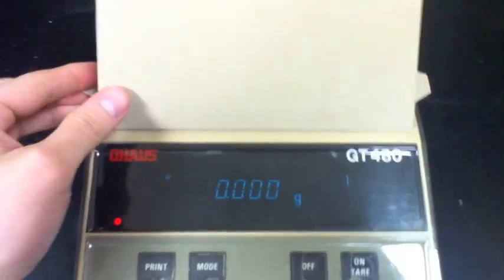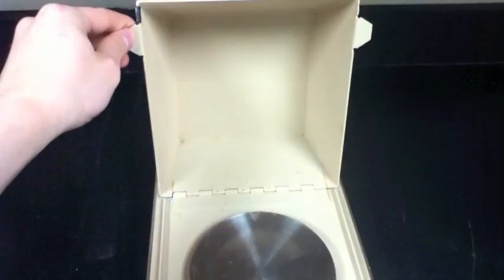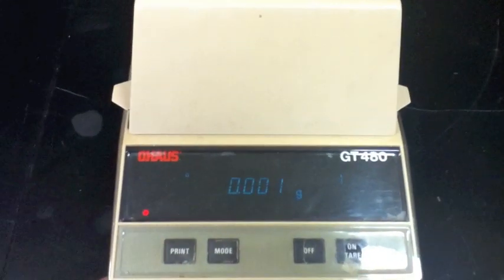Before we re-zero the device, we first must open the lid, exposing the balance platform. Notice that the readout of the device changes depending upon whether the lid is open or closed. Therefore, the lid should be closed whenever obtaining a reading.